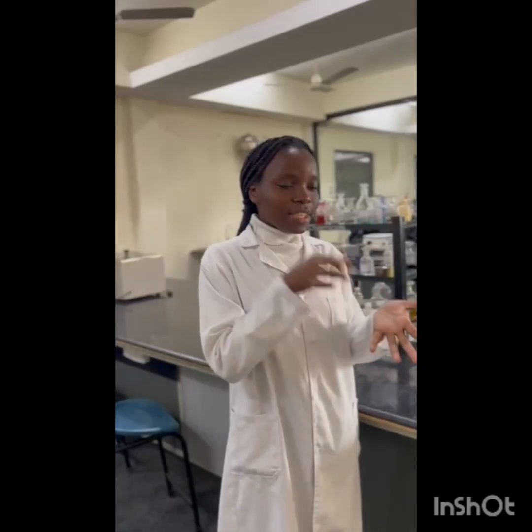One method is the X-ray method. It's not usually used, first because it's expensive, and second because when you use fixatives that have mercuric chloride in them, it's not feasible. It's not convenient to use X-ray. We can also use physical methods, where we take a needle and punch or probe the tissue. But that method is also not convenient because it breaks the tissue.